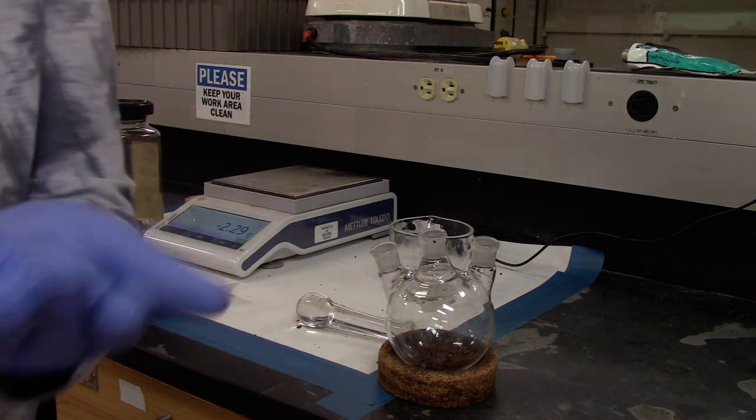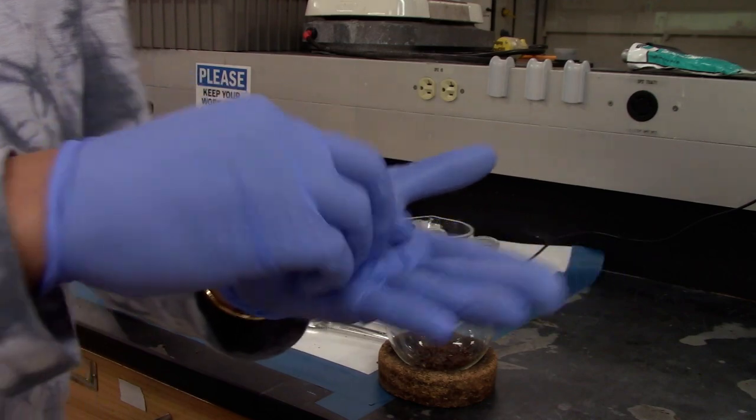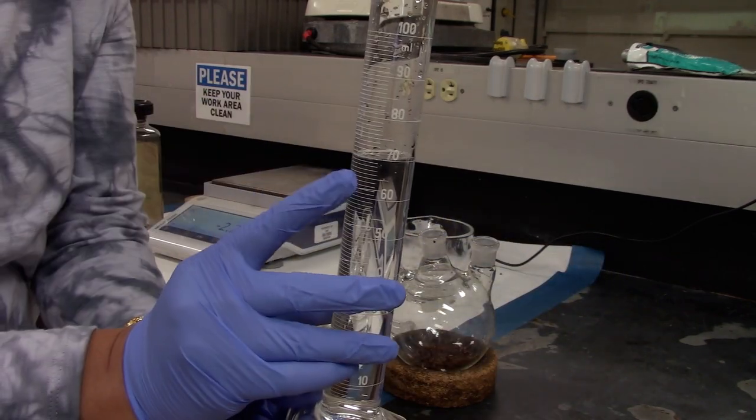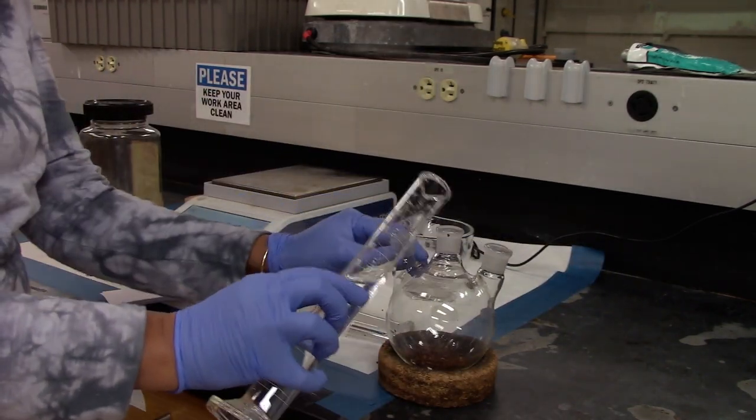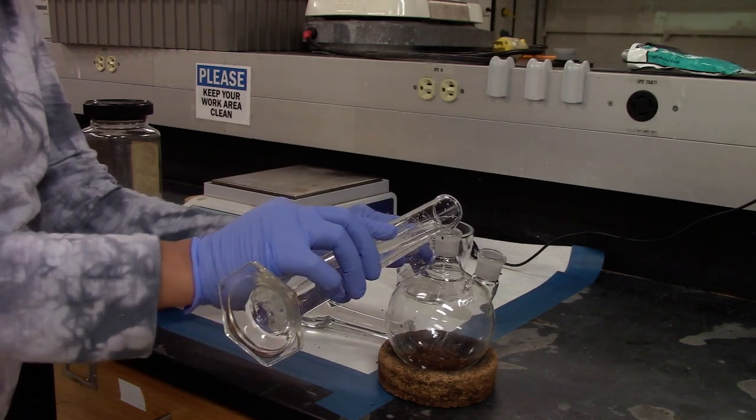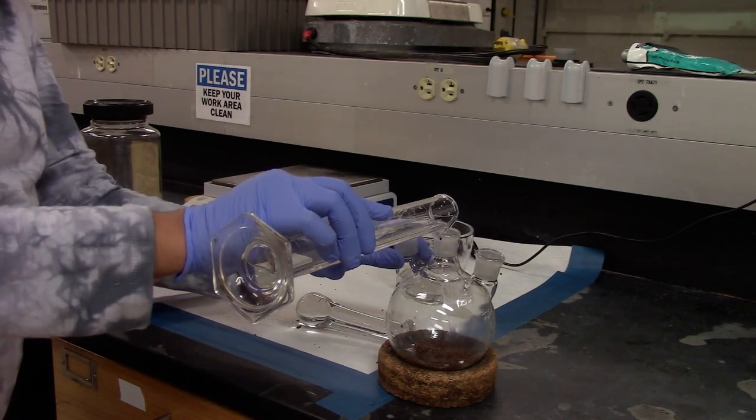Add the crushed clove to the 500ml round bottom flask. Add 2 or 3 boiling stones and 70ml of DI water and let it soak while you set up the glassware.